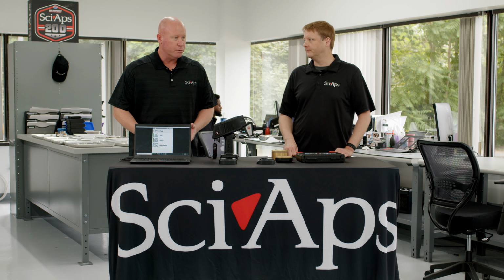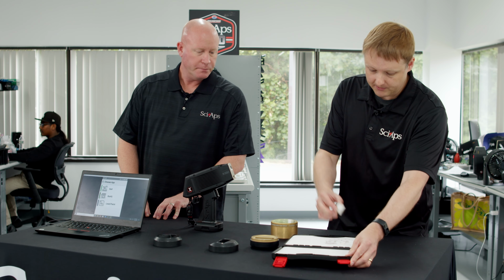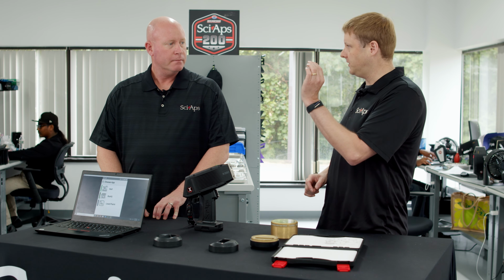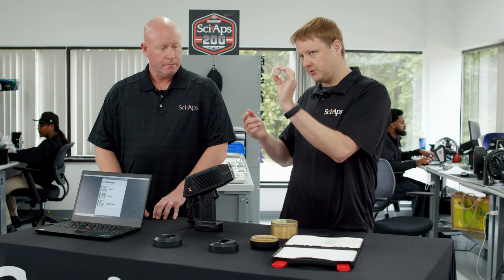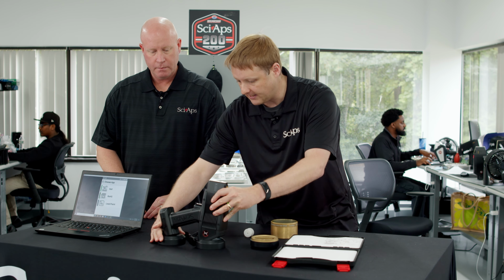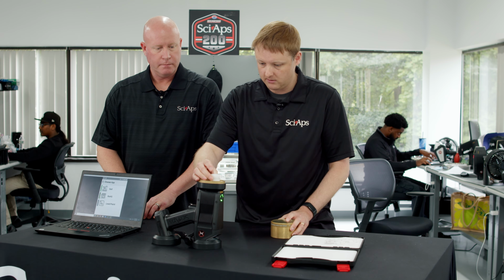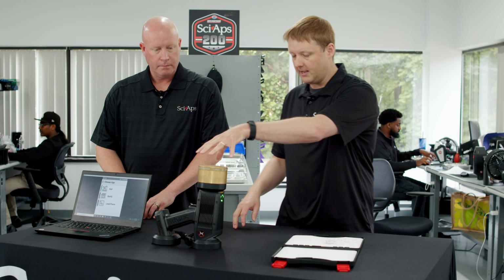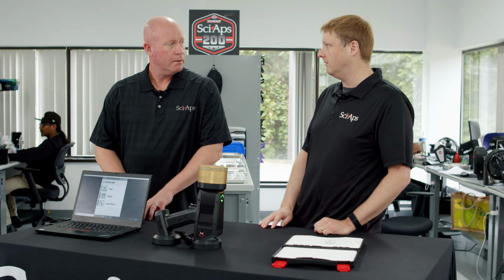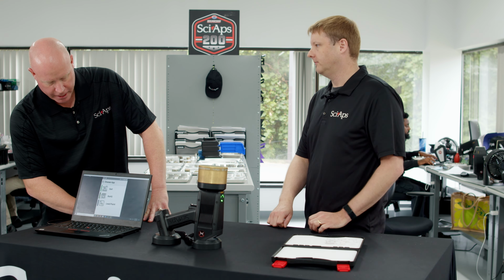What's the easiest way to test a soil sample if I really want the best results? Yeah, so a really common way to prepare samples is to put them into a soil cup. So a sample cup that looks like this, just a little 1-inch diameter plastic cup with a plastic window on the bottom so that the analyzer can shoot x-rays through. And then we're going to put it into a test stand. This is just our small test stand for quick screening of samples. Comes together really quickly, and then put the sample on top, put the x-ray shield on top, and now you can run tests. And it's really convenient for longer tests where the analyzer might be sitting for a minute or so.